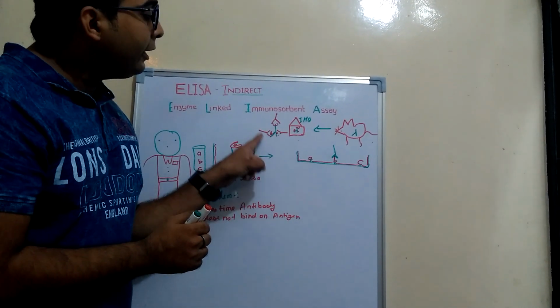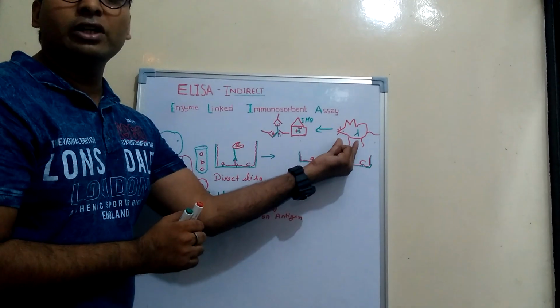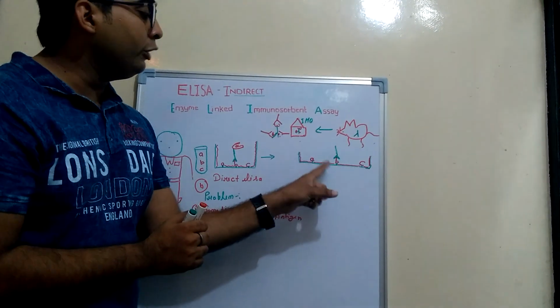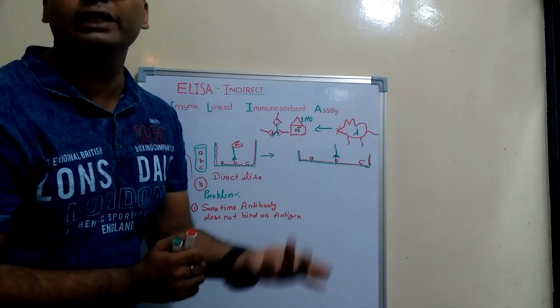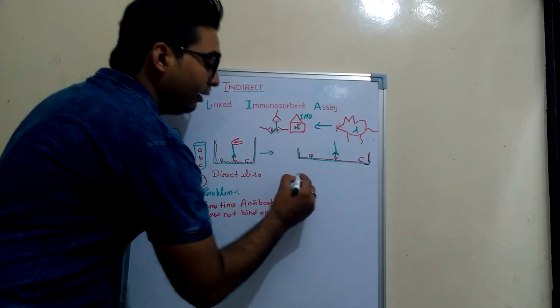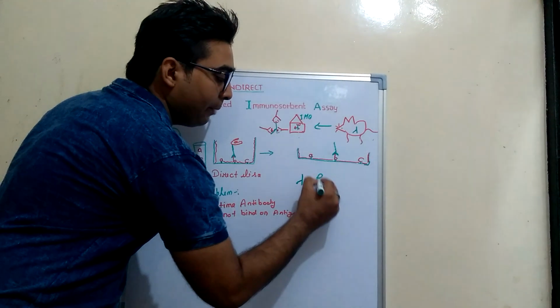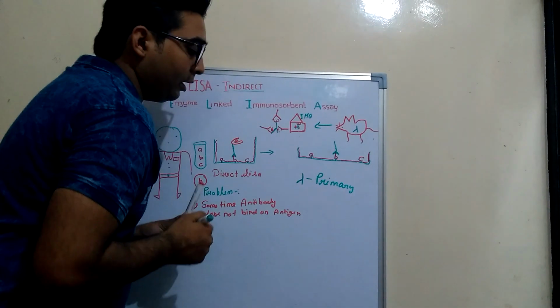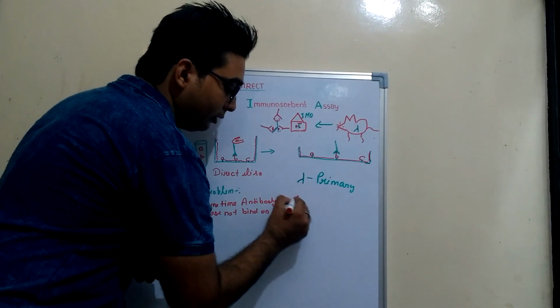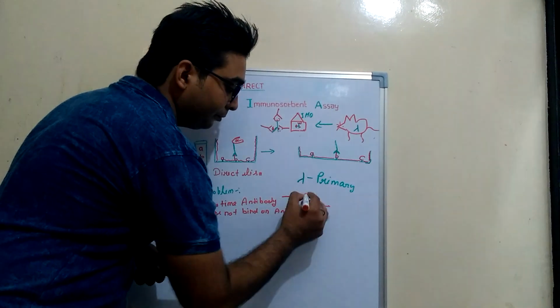Now, the antibody that the mice generate to neutralize this primary antibody will be called the secondary antibody. It means that we have the first, the primary antibody, and we have a secondary antibody like that.